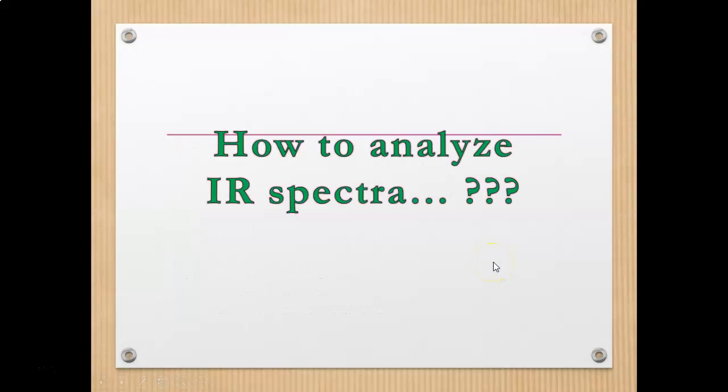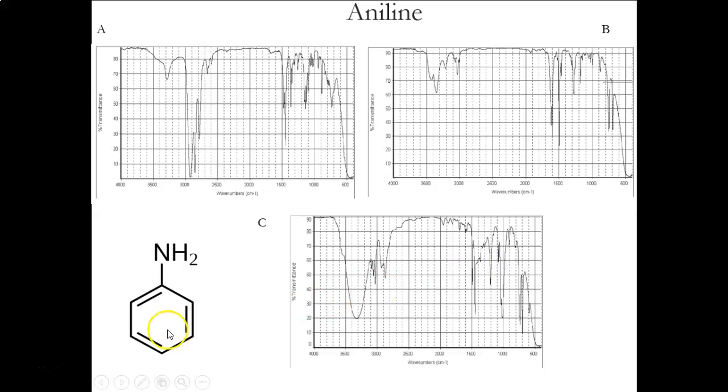How to analyze the IR spectra? I will explain in the next slide.